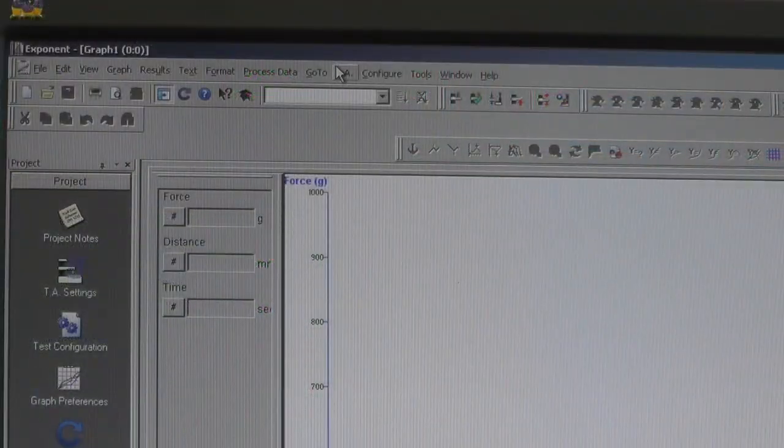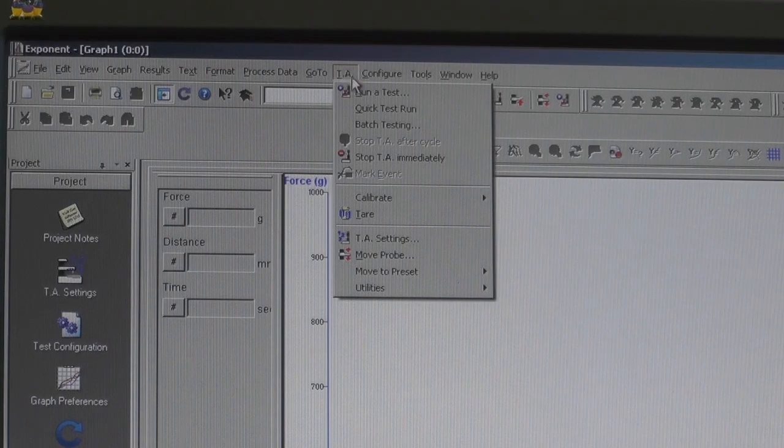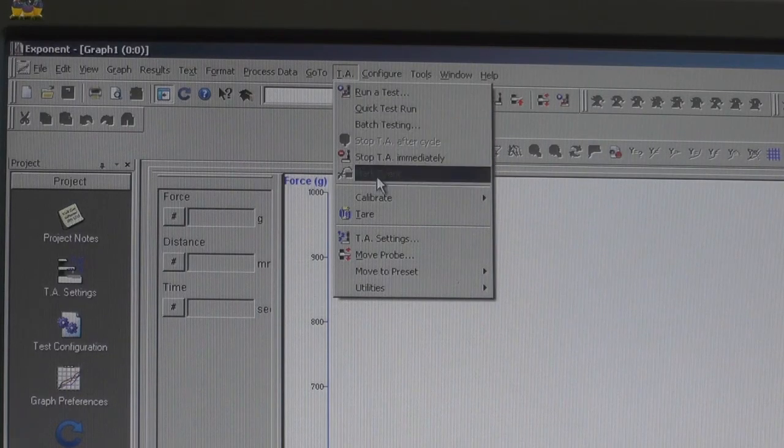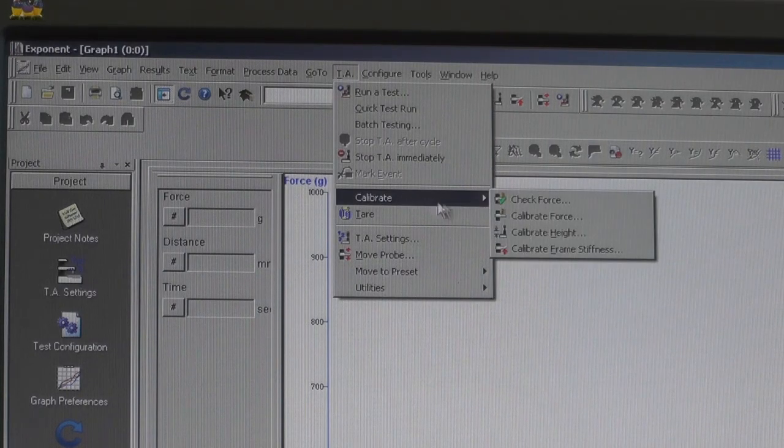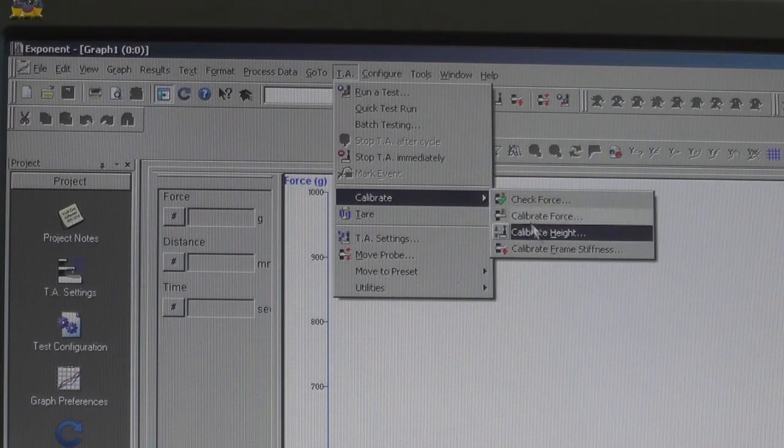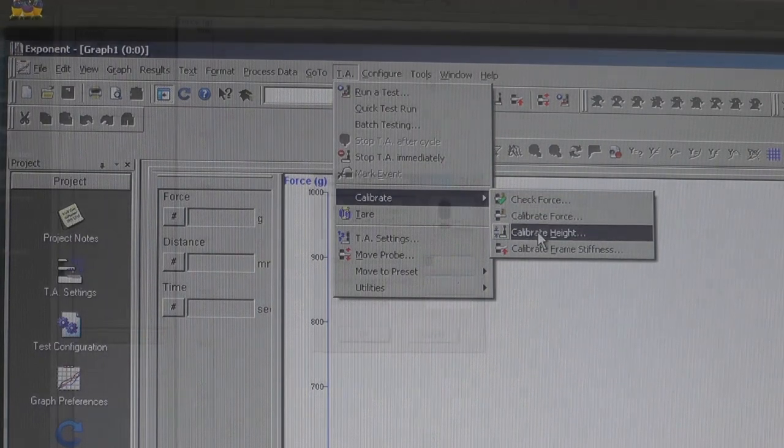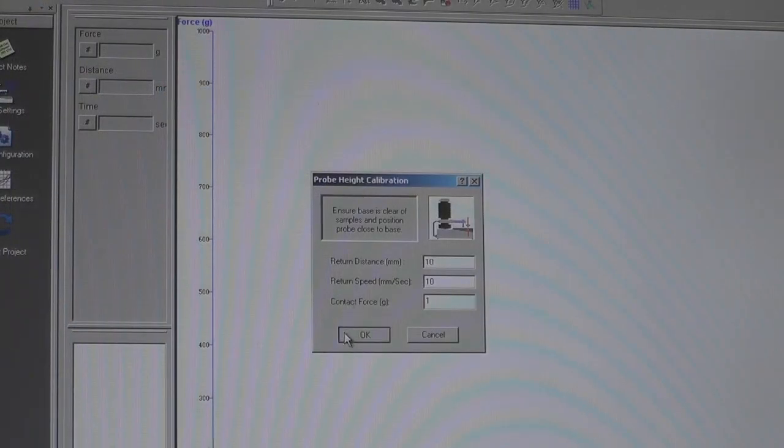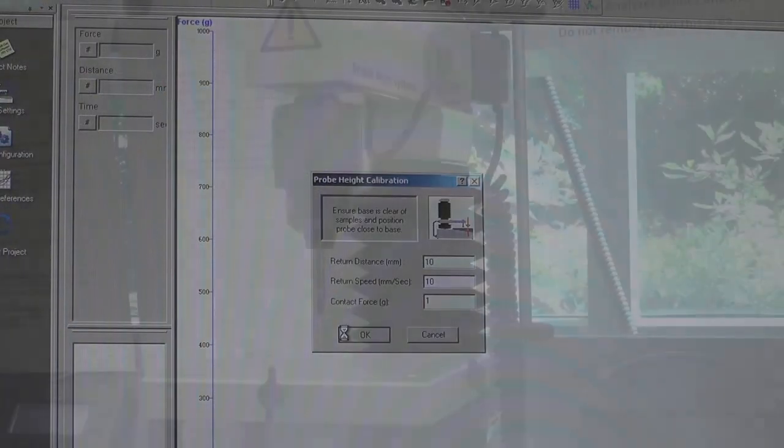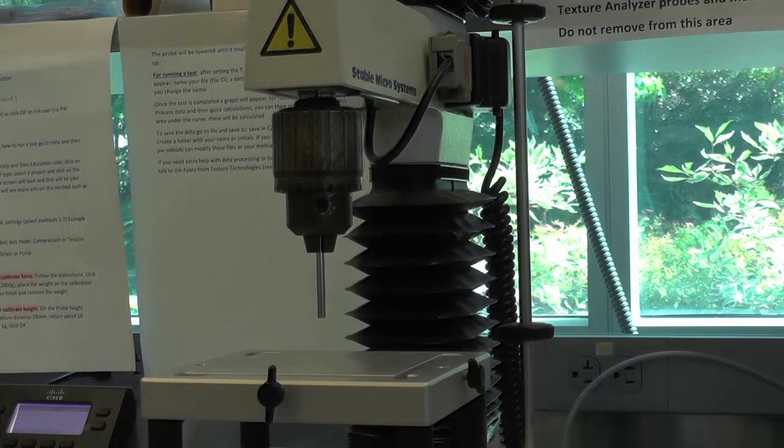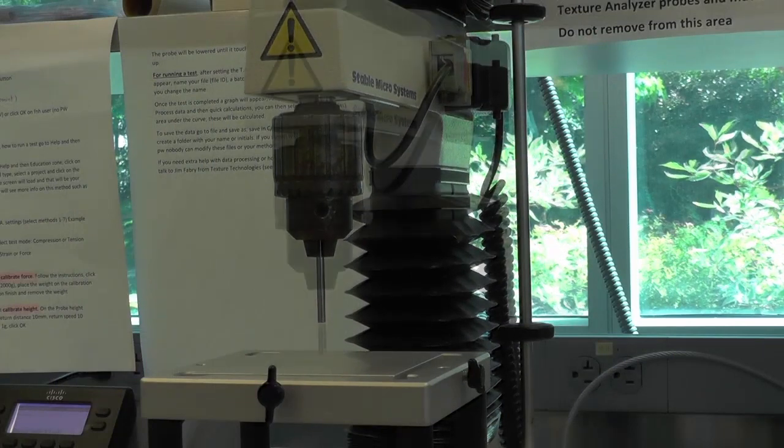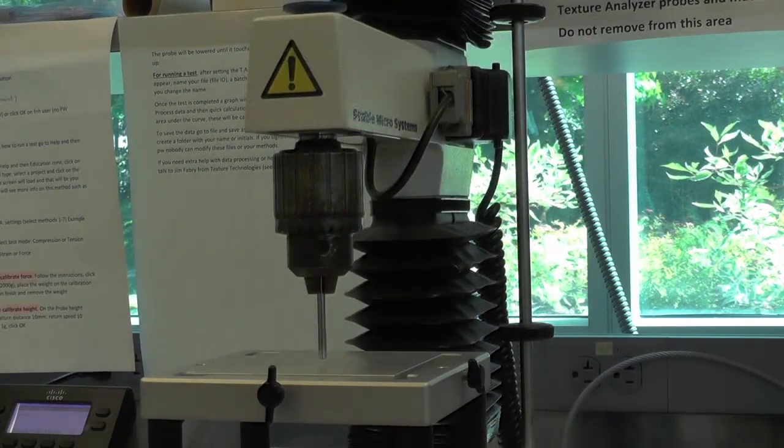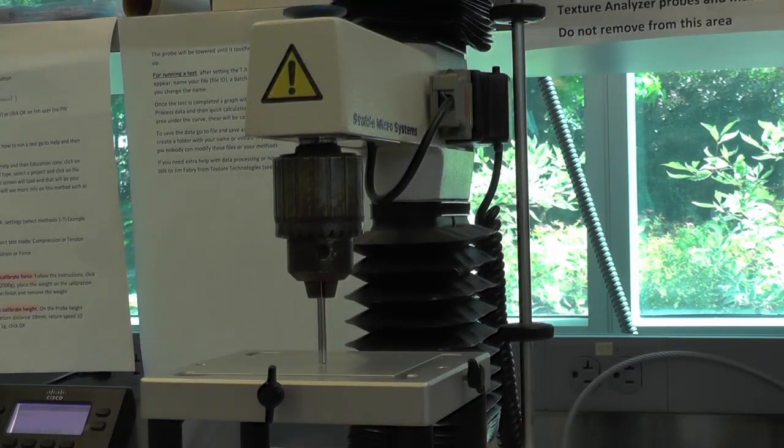Go to the TA tab and again click Calibrate. This time, select Calibrate Height. A probe height calibration screen will pop up. Click OK. The probe will be lowered until it touches the platform and then come back up.